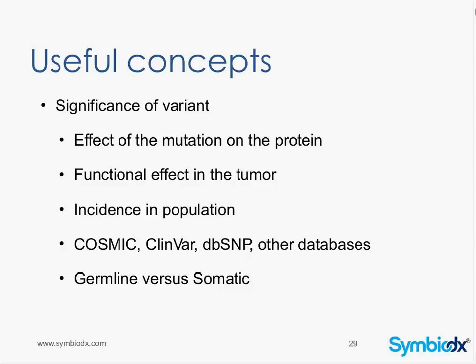The question was, depth of sequencing refers to the number of times each variant is sequenced. So this is the diagram that I showed a little bit earlier. And this is a concept, again, in looking for somatic tumor mutations, particularly.